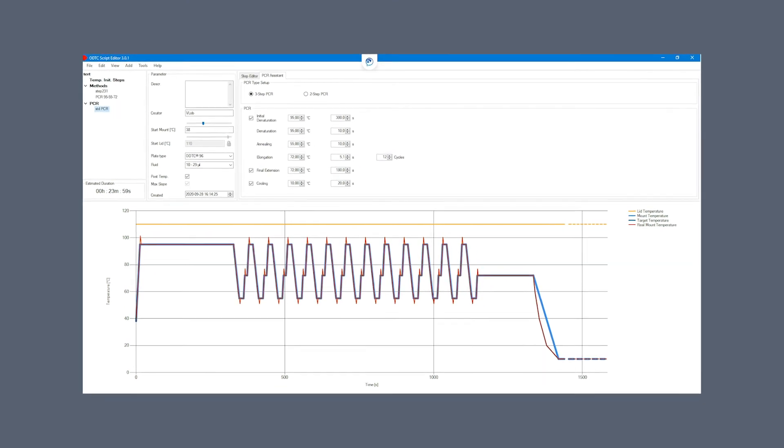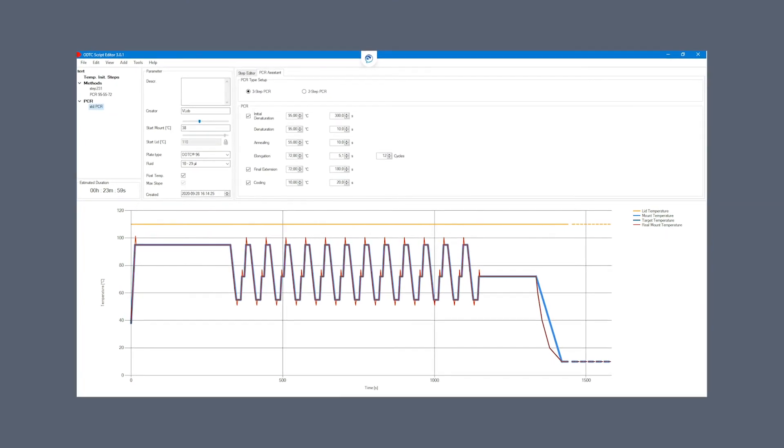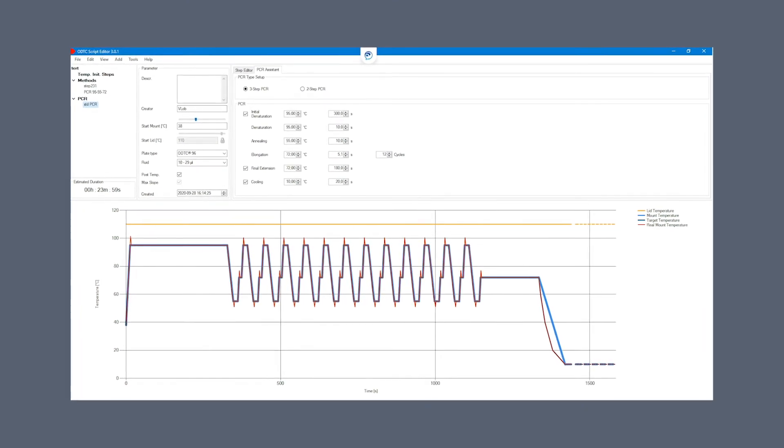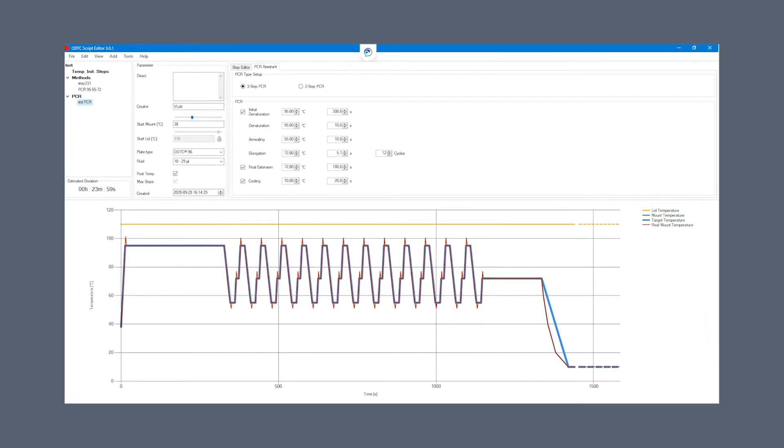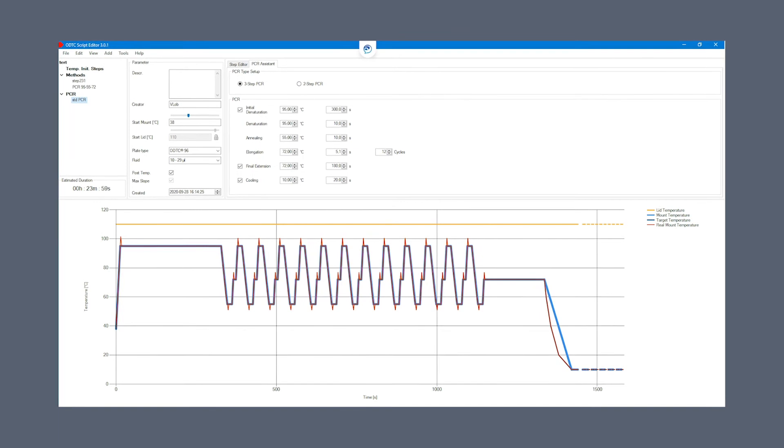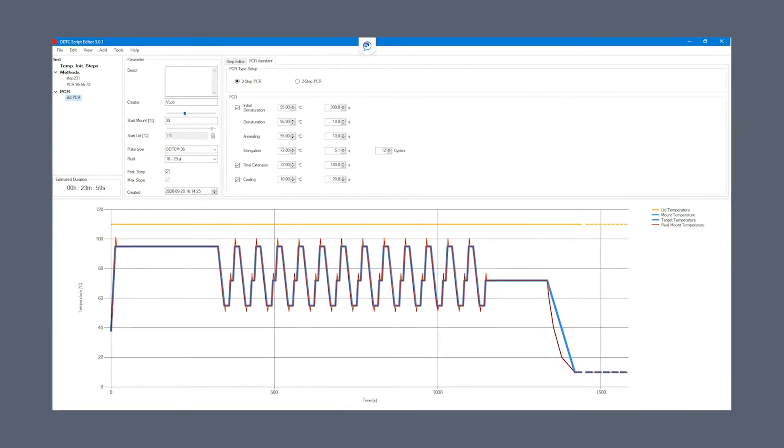Our provided software and script editor make adjusting your parameters and cycle runs simple and intuitive.